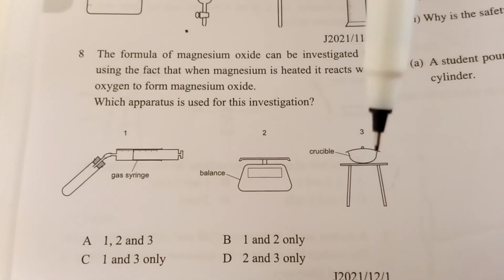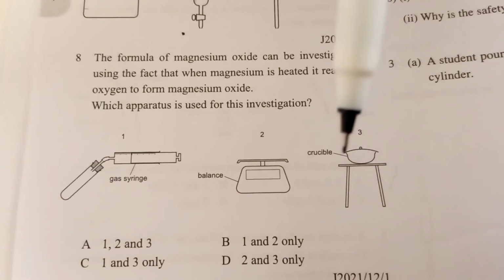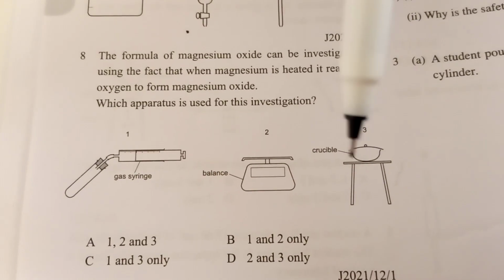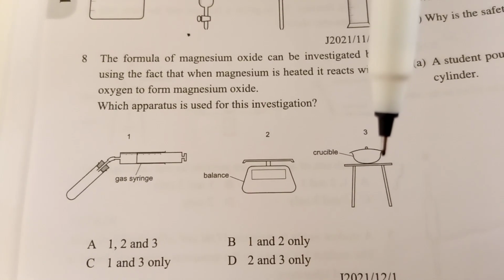We take the crucible and the lid and weigh it on a balance. We get the mass of crucible, lid plus magnesium before heating.